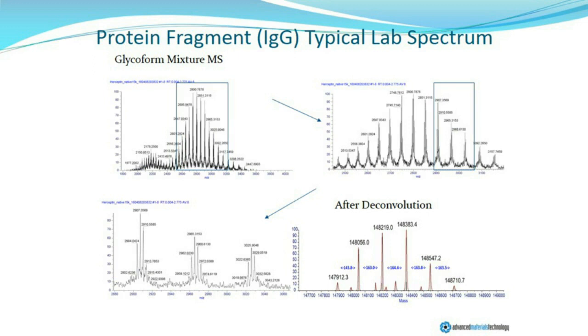What is also apparent is that in addition to those glycosylation variants, there are additional variants that appear in the deconvoluted mass spectral data, and we're not always confident that we know whether those represent additional variants in glycosylation or variants in the IgG polypeptide backbone. That is, at the protein level versus the glycosylation variants.